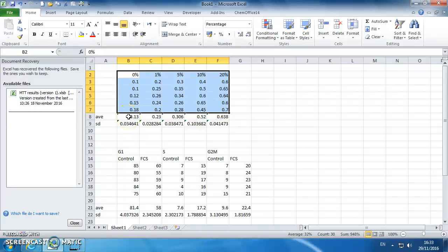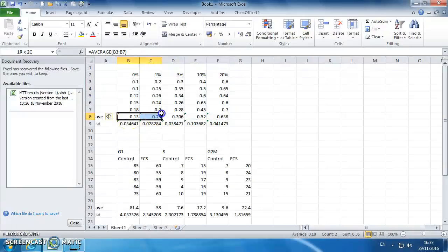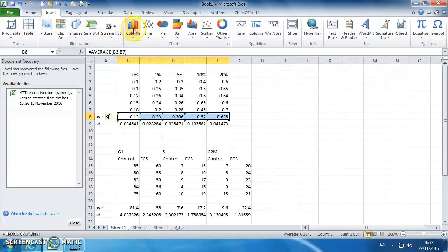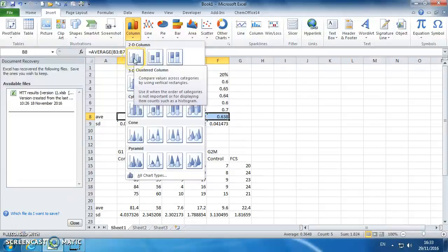Okay, so we've got the MTT data. We've calculated an average and a standard deviation for each treatment group. Highlight your averages, insert, column, pick the top left.